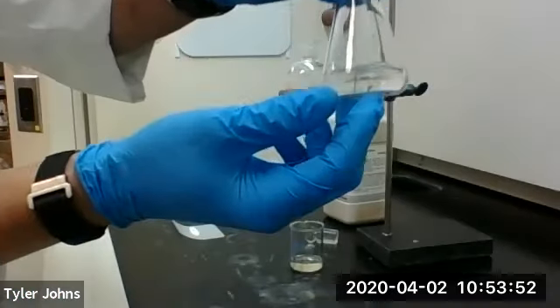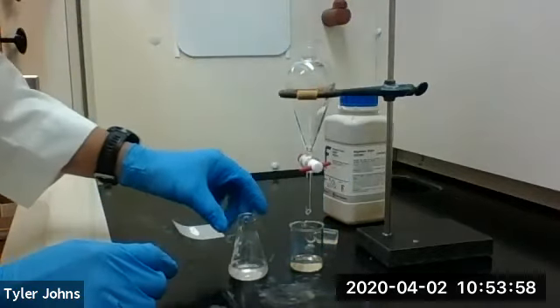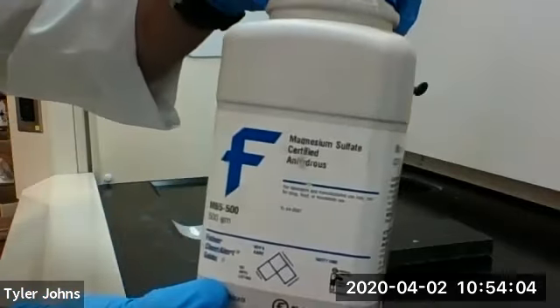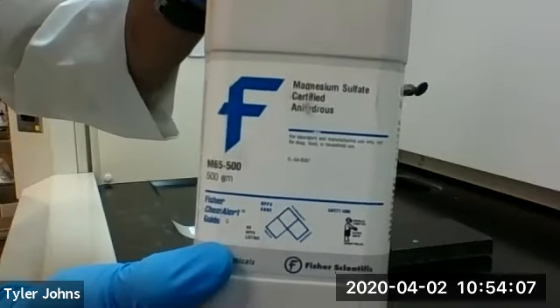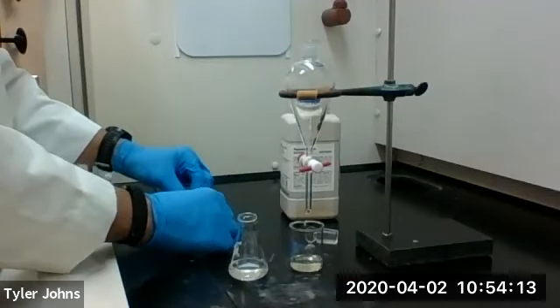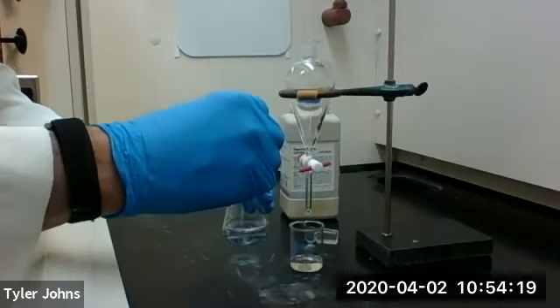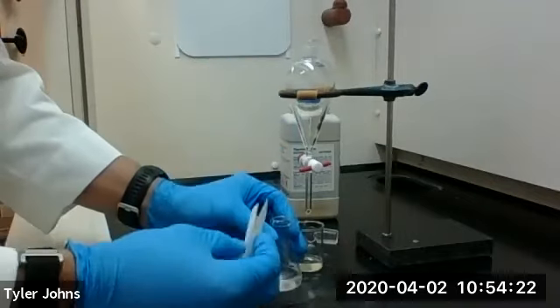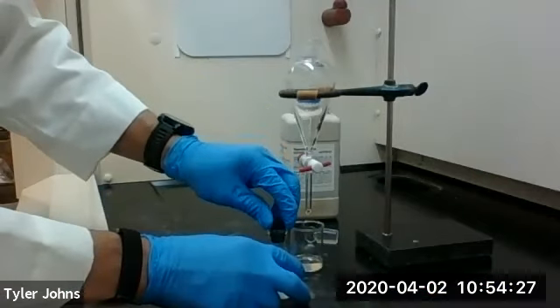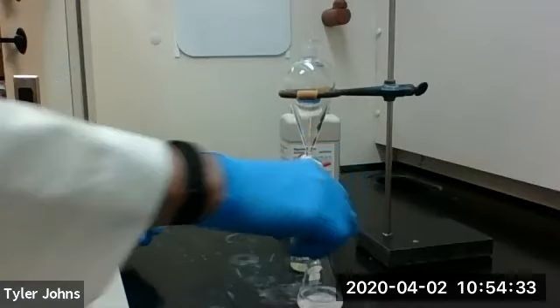So we have our ether extracts combined in this Erlenmeyer flask. We're now going to dry our ether extracts with anhydrous magnesium sulfate. I already have some out right here, so we're going to add the anhydrous magnesium sulfate, cork our flask, and allow that to dry for about five or ten minutes.